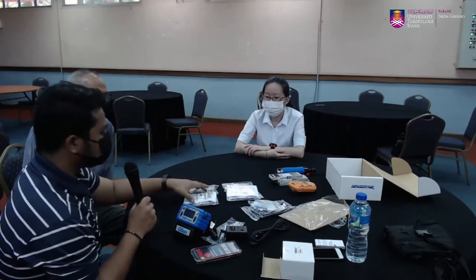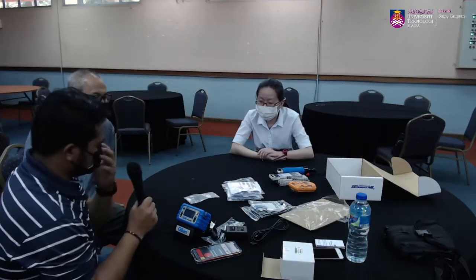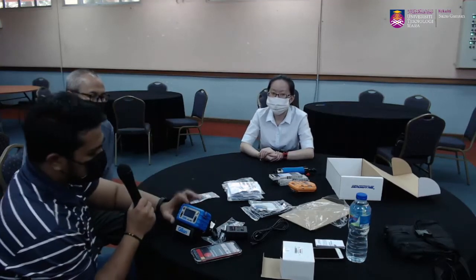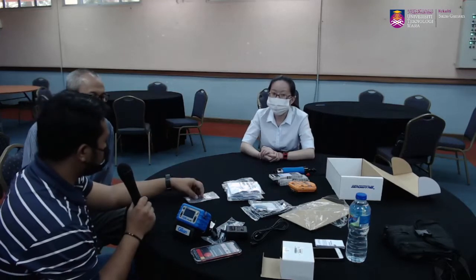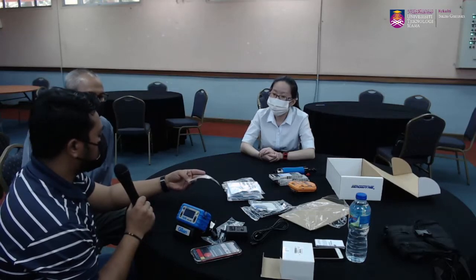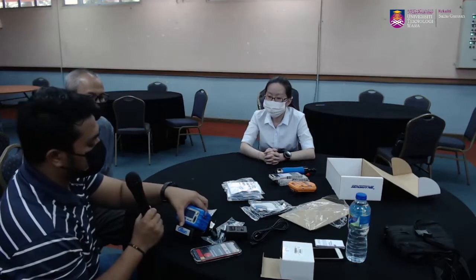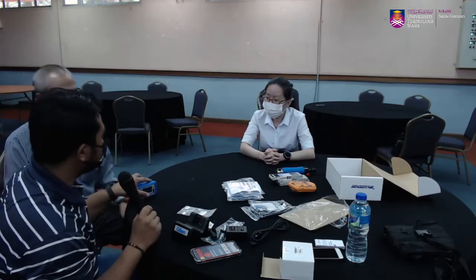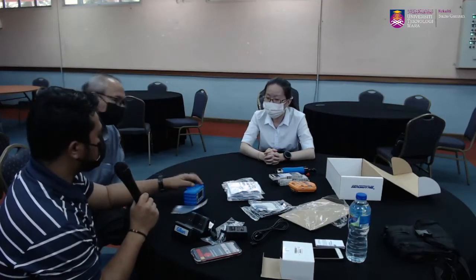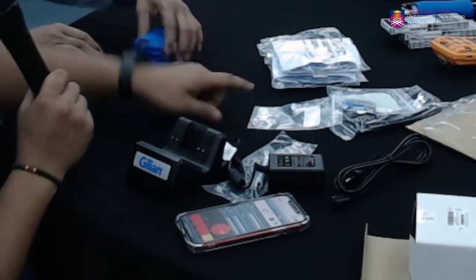Okay. And then in terms of dia punya maintenance, usually-nya kalau you rasa that the pump kadang-kadang dia dah you set 100, dia susah ataupun lambat nak reach, you boleh buat your own preventive maintenance, where kita juga provide you in terms of filter. So kalau kita nak tengok filter ni dekat bahagian mana at this pump, is dekat bahagian tepi. Okay, so dekat bahagian tepi ni ada 2 screws. So daripada 2 screws ni kita just unscrew and then kita tukar the filter. And then daripada situ kita boleh analyze the pump.